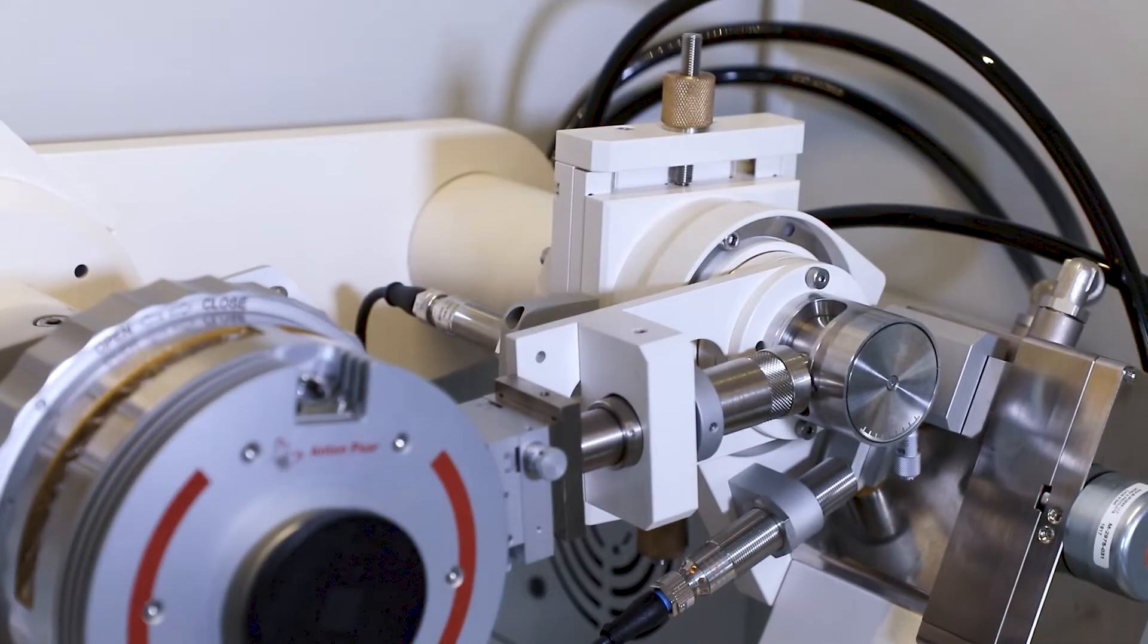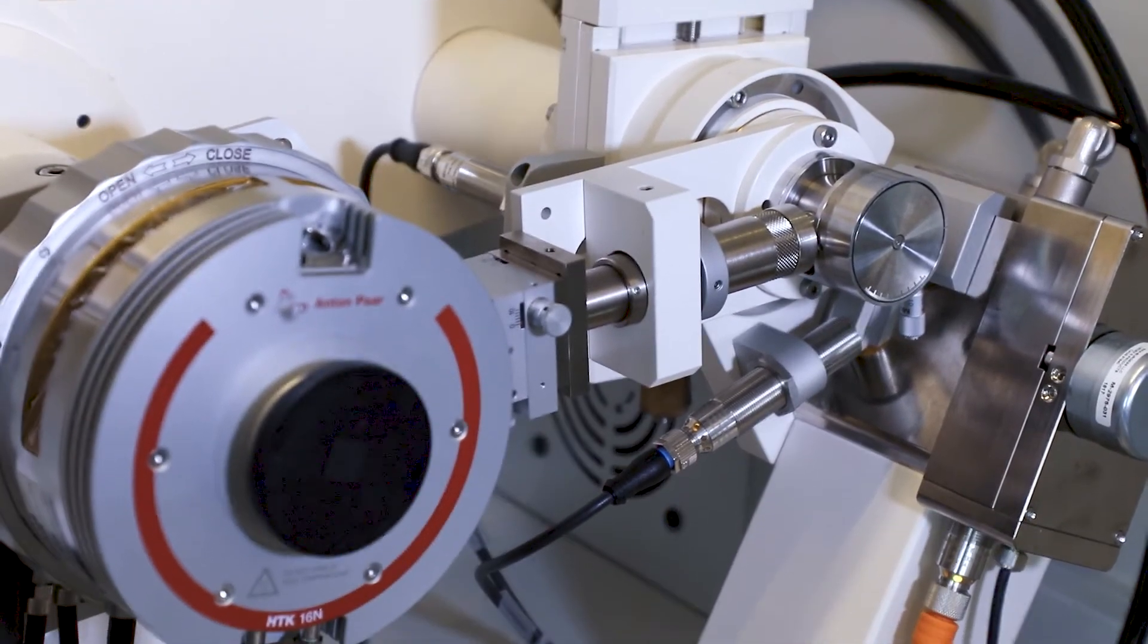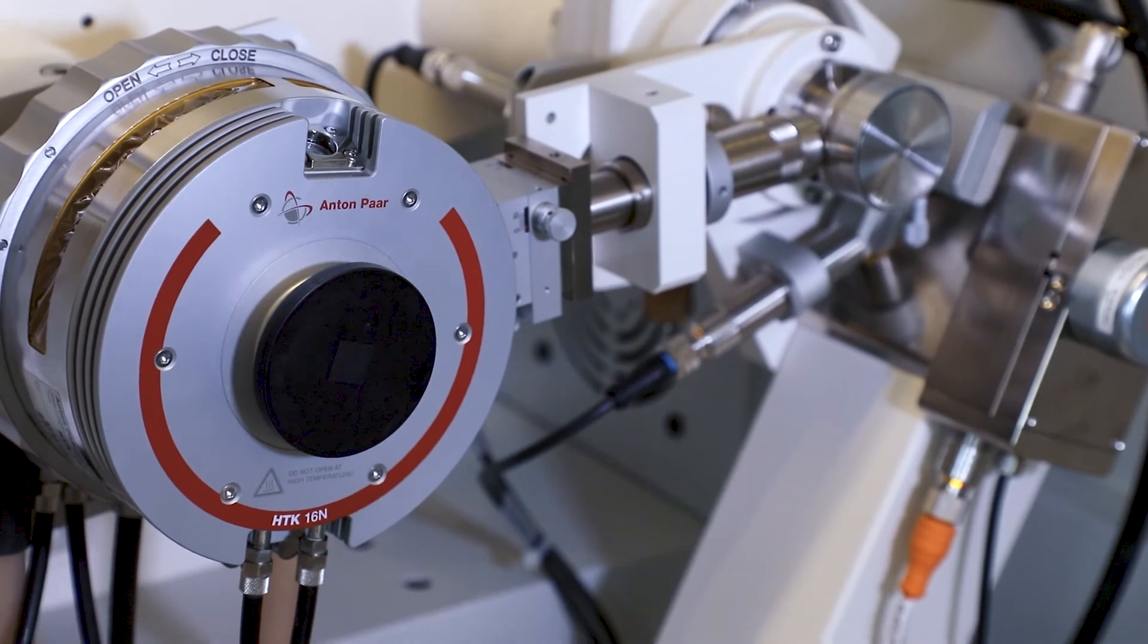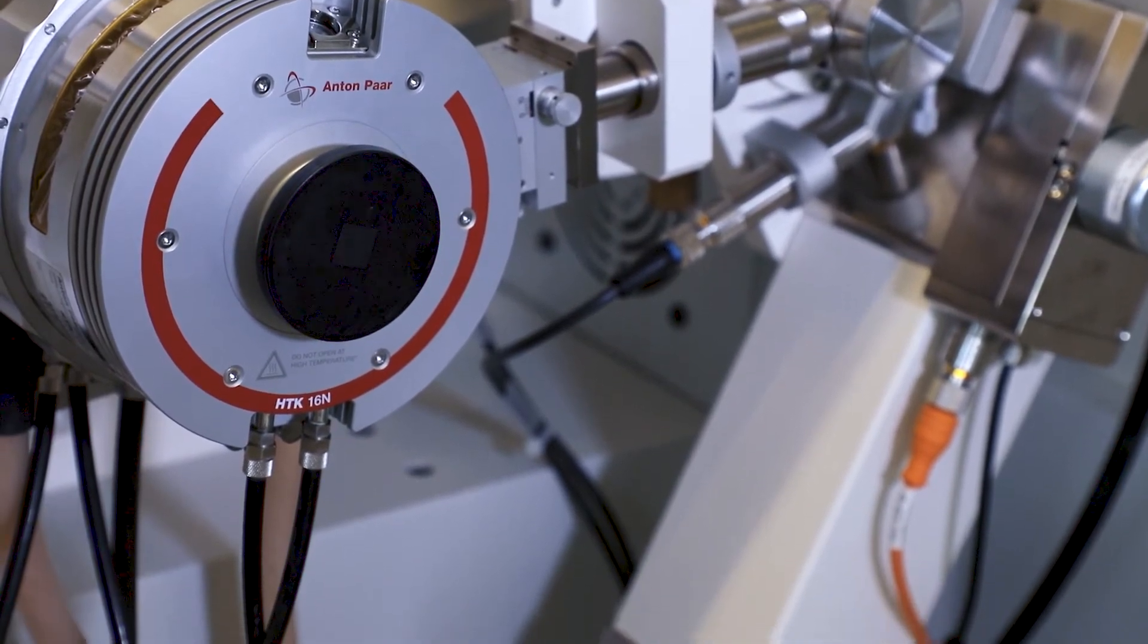These instruments are a cost-effective solution for routine QC/QA, dynamic studies, formulation determinations, and materials R&D.